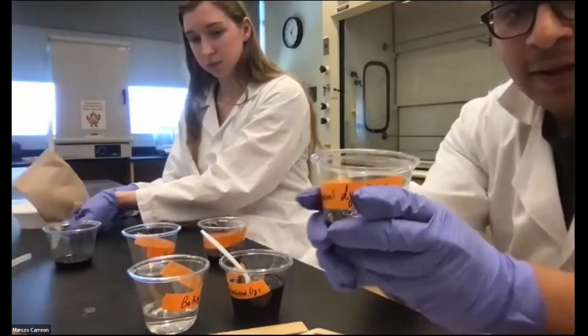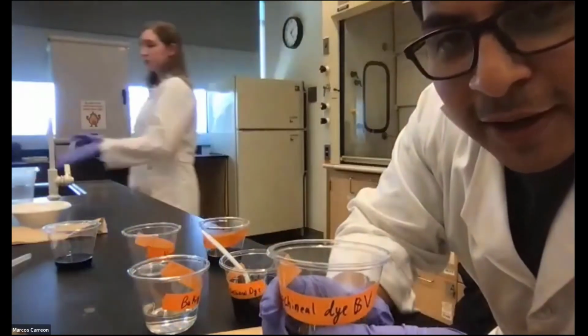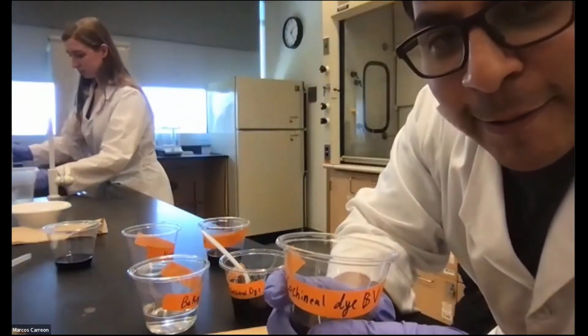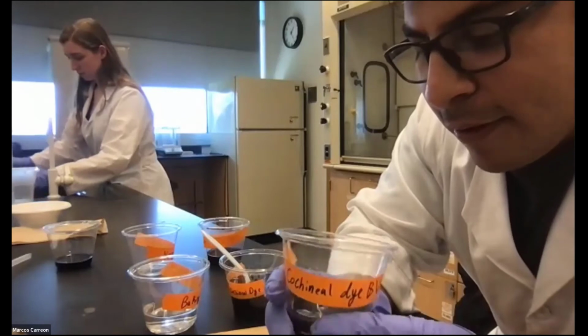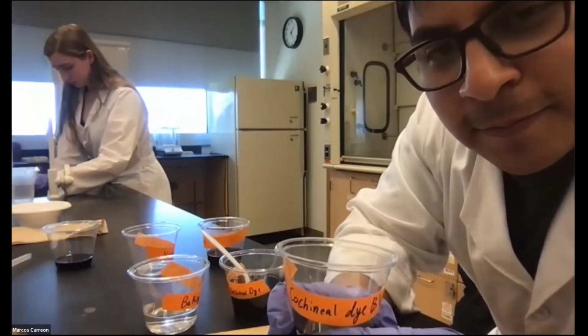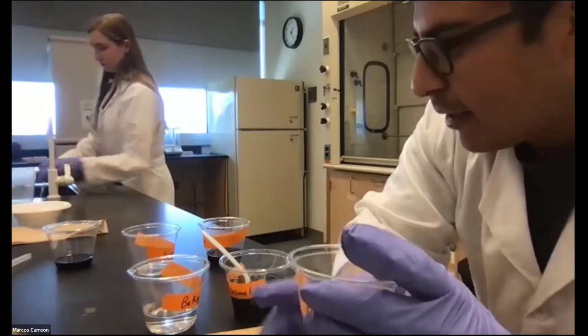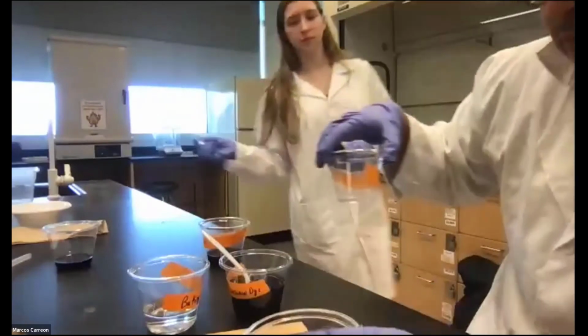So it's saying lighter. Lighter, what color? What do you guys think it's gonna be? What kind of lighter color do you guys think? If there is, what color is it? I'll let you guys think about that before I add the vinegar.